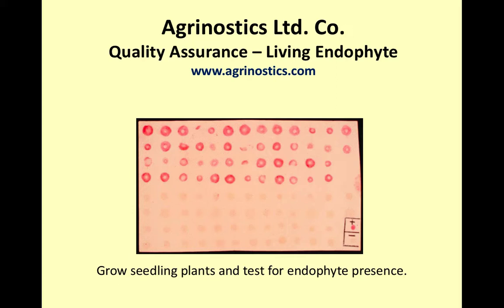Not only that, but we need to start asking the question, how many of these endophytes that are in the seed are actually viable and being transmitted to the next generation of plants? So we also have a test for that, which these companies do. And these little circles that you see here are from plants that we've grown in the greenhouse. And at the stem base, we've made a horizontal cut. And we just get a little wafer of that and place that on this special tissue that we've got here, a special membrane. So these are basically just circles or cross sections of stem bases, okay?